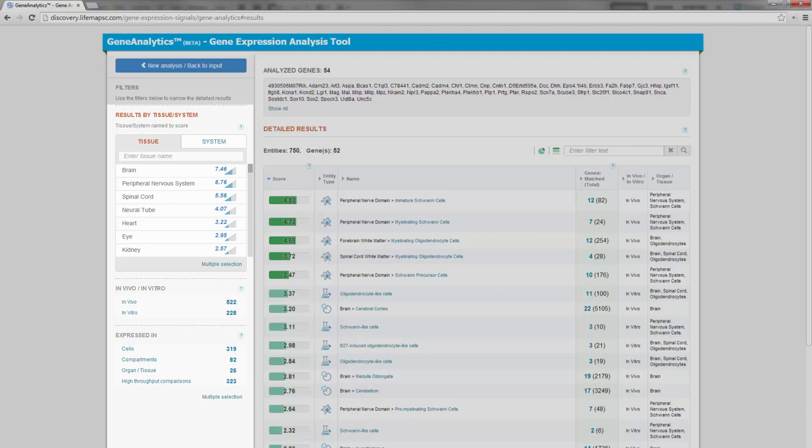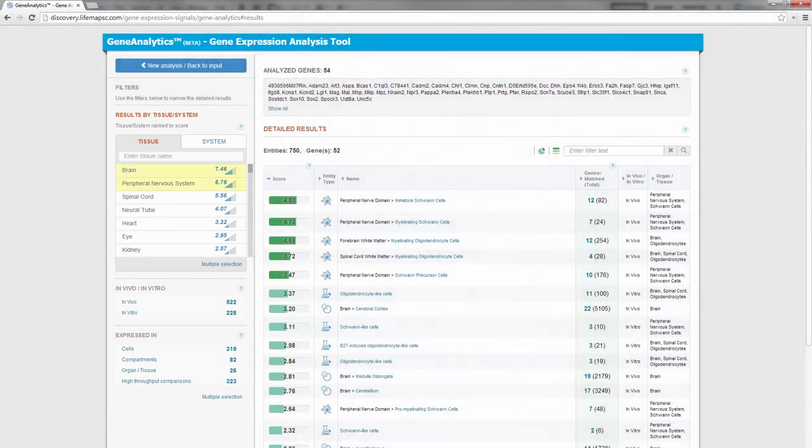Surprisingly, we see that the best matched tissues to our gene set are the brain and peripheral nervous systems, and not the dermis as we would expect. This suggests that the isolated cells are not a pure dermal population.